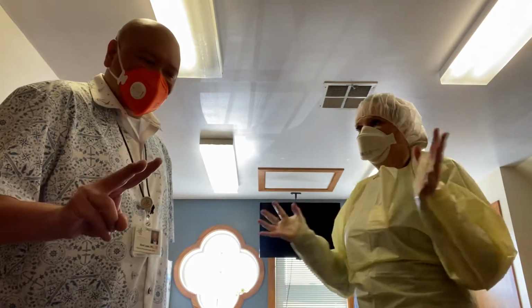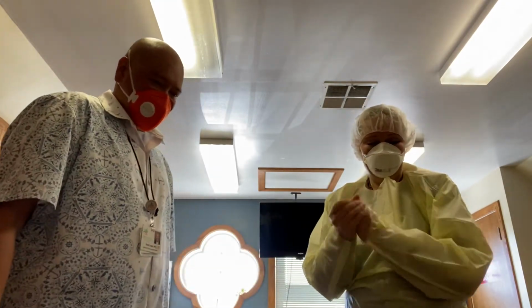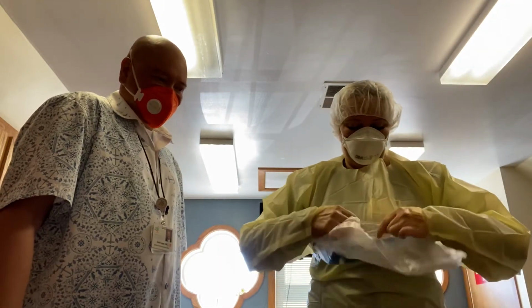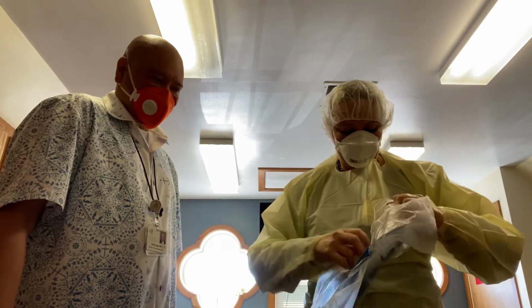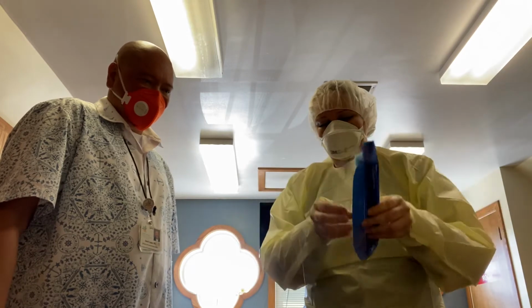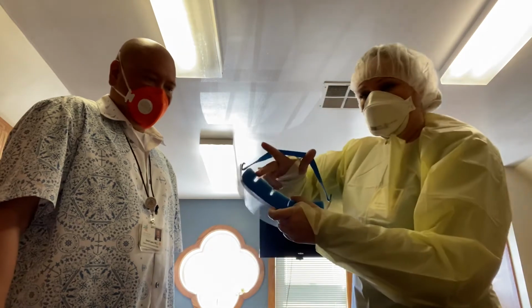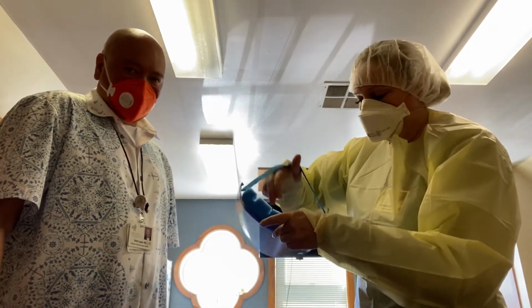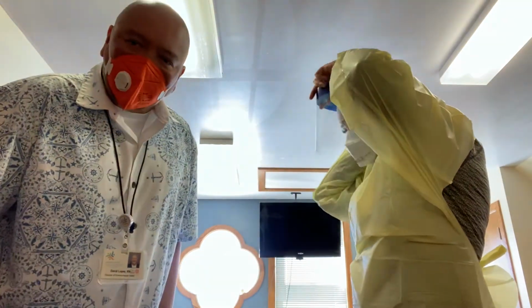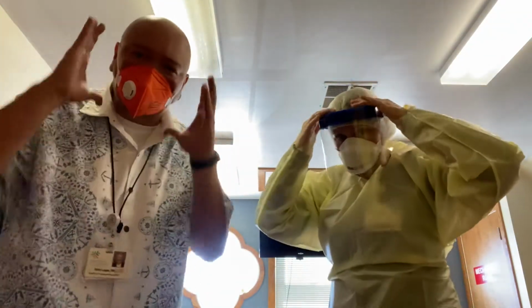Then the next step is to make sure that we put the face shield on. This has an elastic that goes around the back of your head, and the face shield covers the front. It has foam along the top, so it prevents things from going into your eyes. So this is your eye protection as well. If you don't have a face shield, face goggles would work, but we prefer the shield because it covers the entire face.